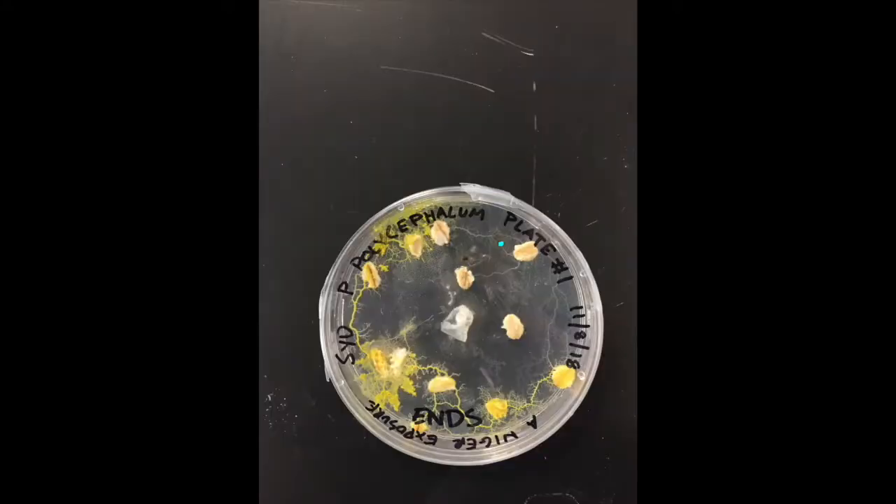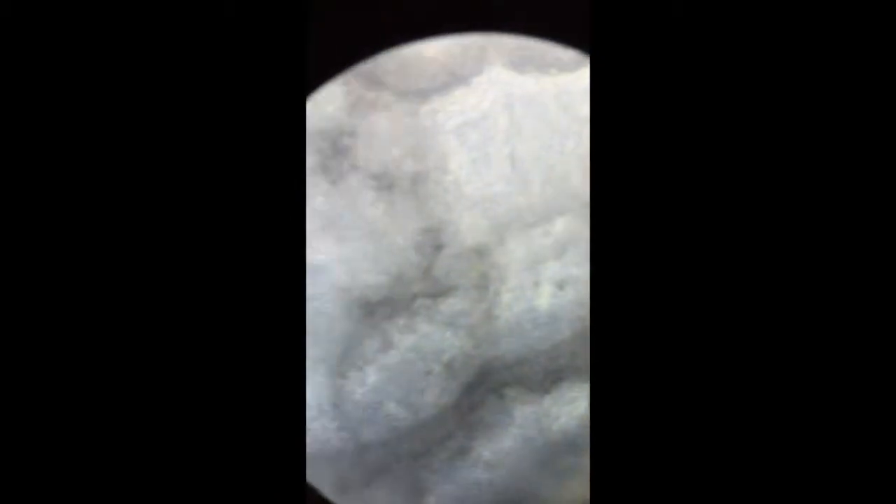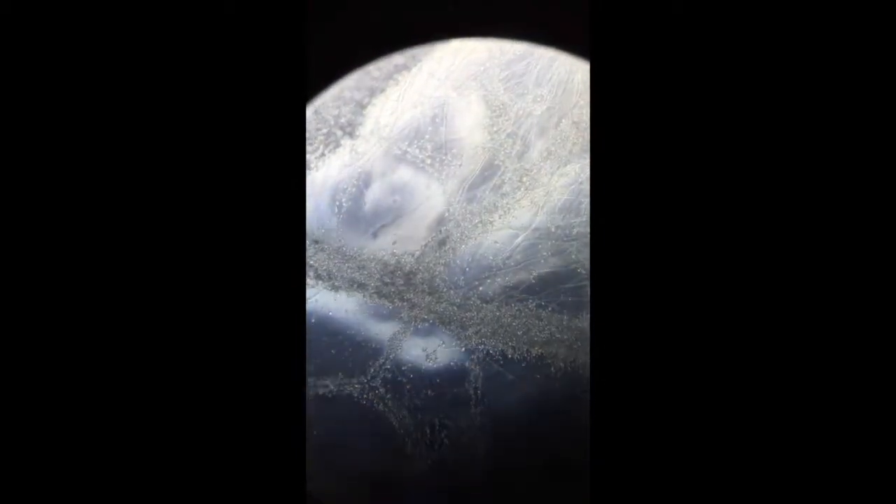Looking at the rightmost point again, pretty much the same thing — totally taken over by Aniger, at least in that small point.